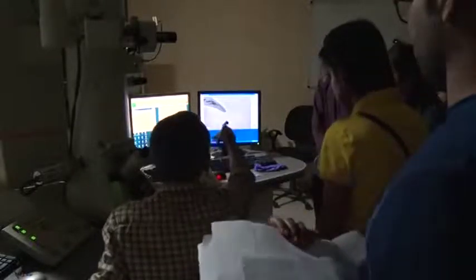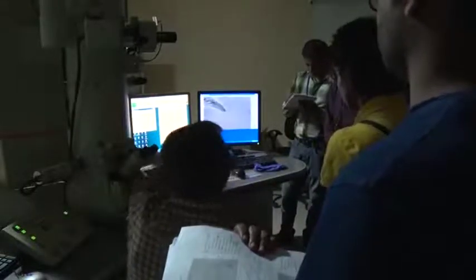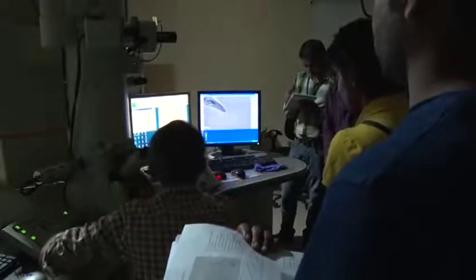So there will be some movement. We will see how it looks. That is called a high tension wobbler, and I have started it, and you see that there is slight movement, but it may not be slight. So what I will do is misalign it a little bit so that we can correct it later. So I go to bright tilt here. As you can see, tilt means I am trying to tilt the optic axis of the objective lens a little bit with this deflection. Now the lower ones, we'll do both. We'll try to correct it, change it somehow, and let's see how it works.